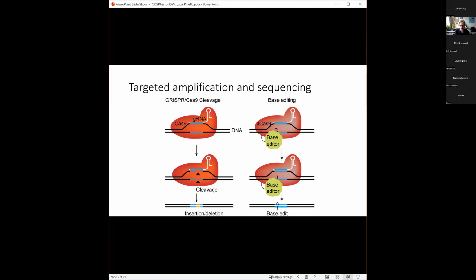So let's explain this. For many of you this would be familiar, but you have your editor choice. For example, you can have CRISPR-Cas9 that will be targeted to your site of interest, and will introduce double-strand breaks, and this will result in insertions and deletions. And with base editing, we learned instead that you can introduce more or less precise substitutions.